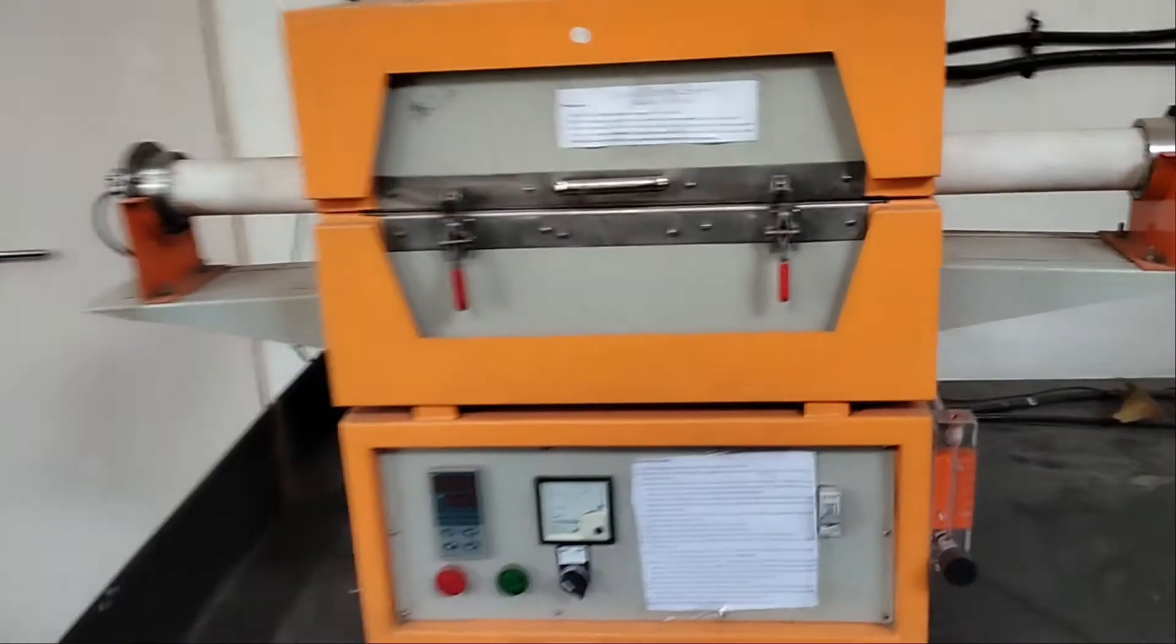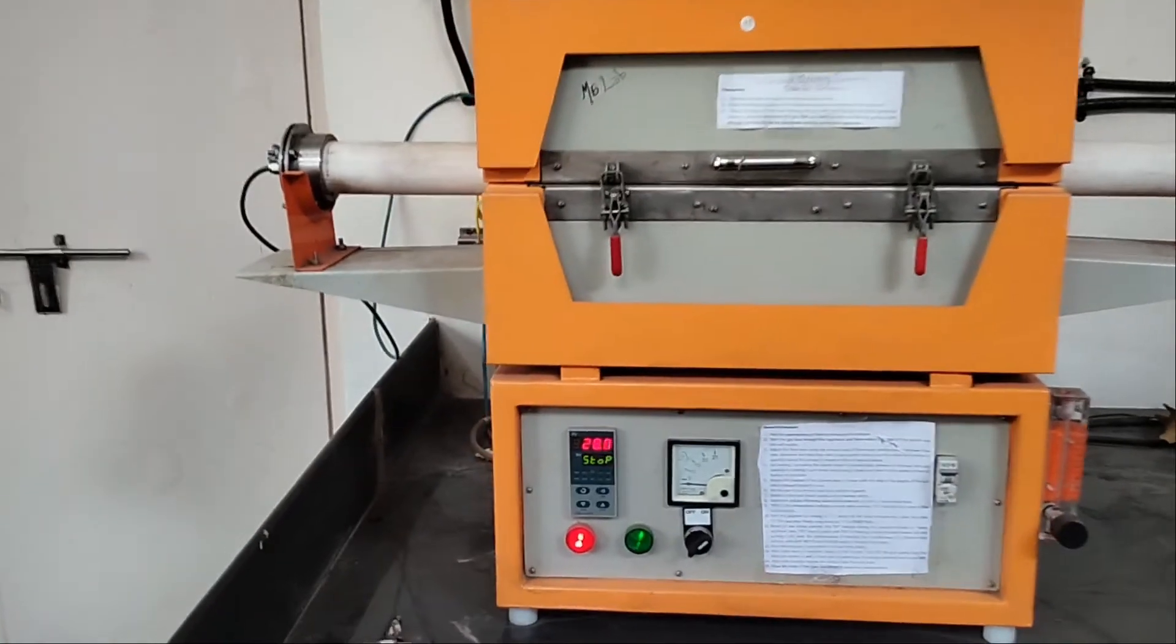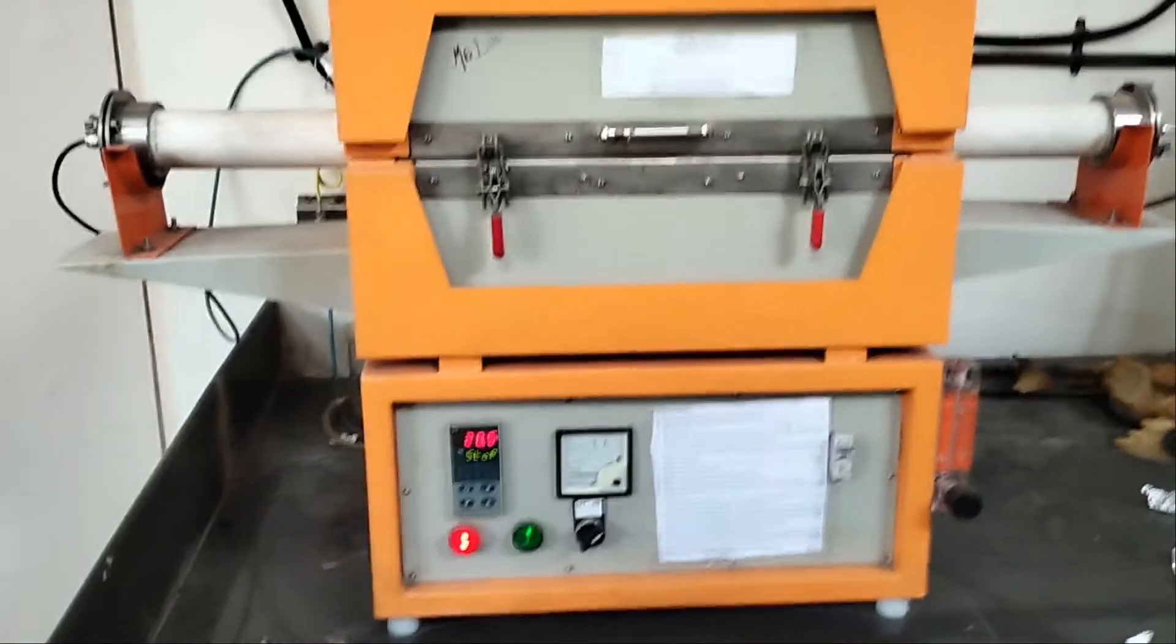Now once everything is set and the flow is established, you can turn on the tube furnace. This display will come on, and the program has to be given manually in that system.